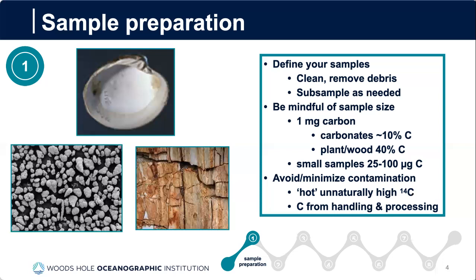So please take the time to investigate the history of the lab spaces and equipment where you collect and prepare samples before submitting them. And if you suspect tracer work, the first thing we would recommend is that you do a swab test to test for gross contamination. And then we also can perform swipe tests to really dial down and make sure that you don't have tracer level contamination in your lab space or with your laboratory equipment.